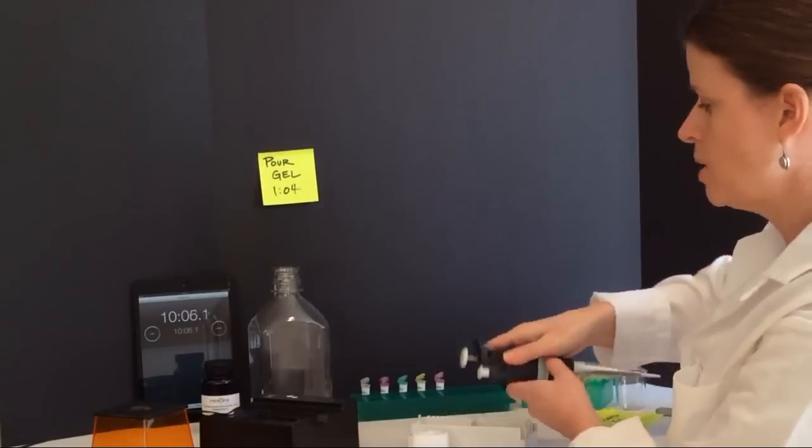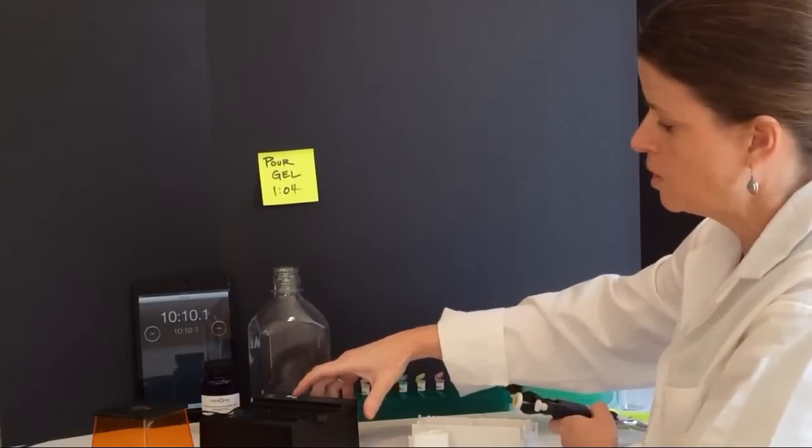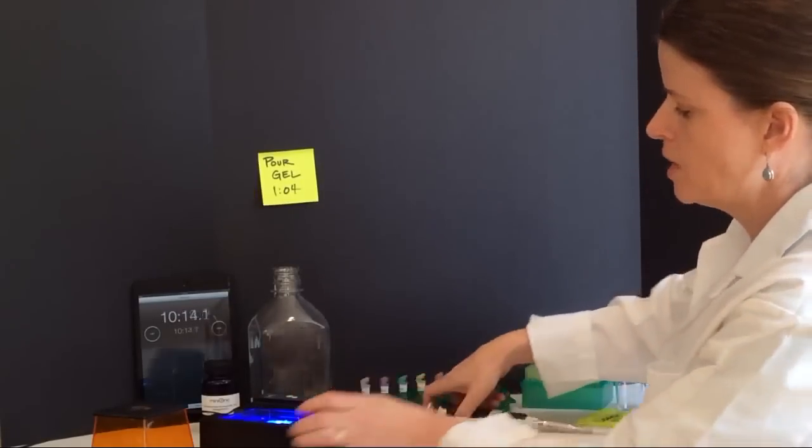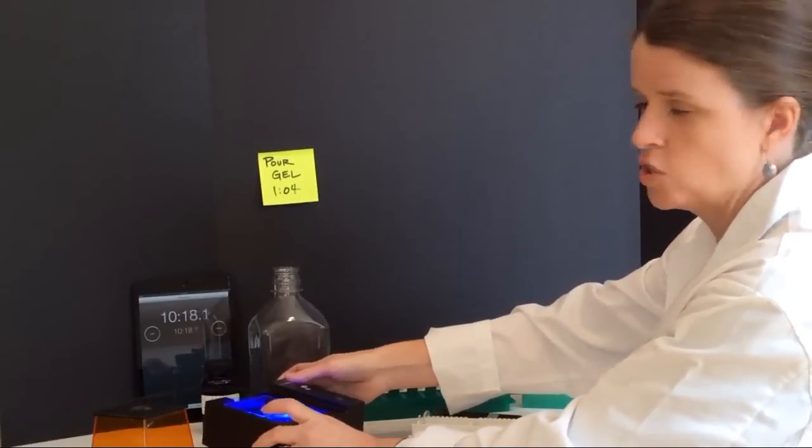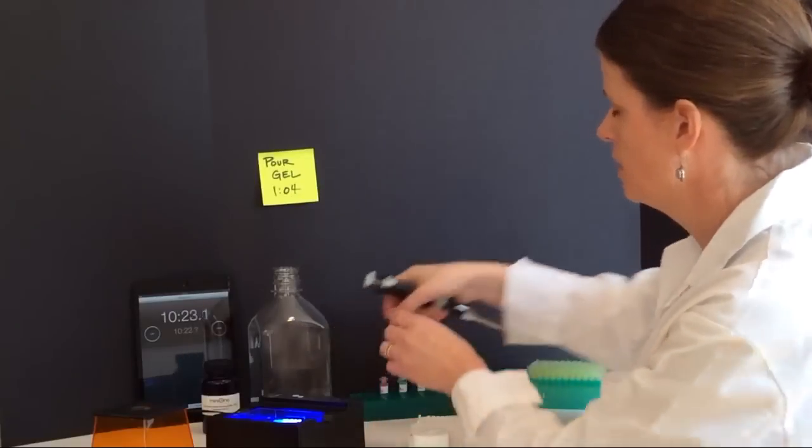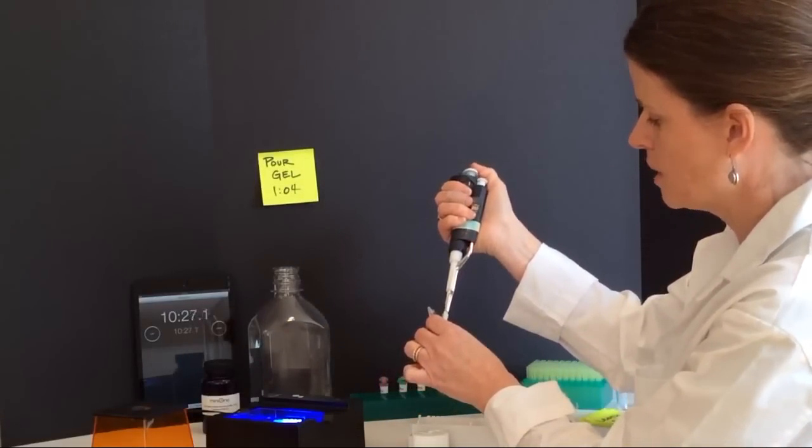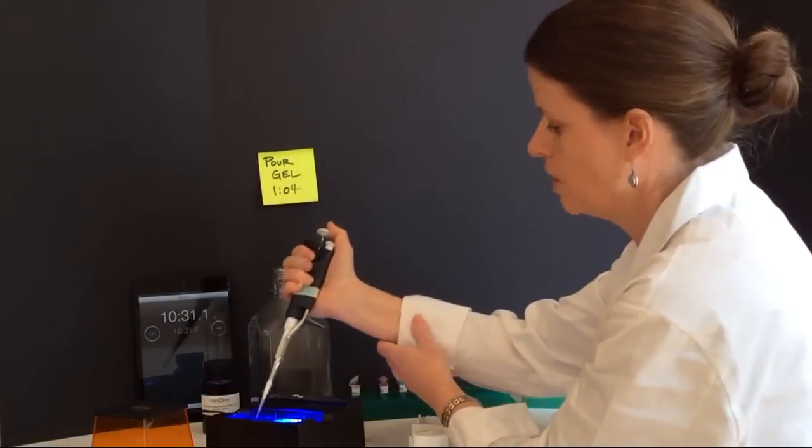Once I've done that, I'm going to use one of my favorite features of the Mini One setup, which is I'm going to turn on one of the low lights and this is going to give me a nice contrast with the back of my gel, so that I can see my wells and visualize for loading. With this gel light for the loading process, I found that even novice students are able to successfully load a gel.